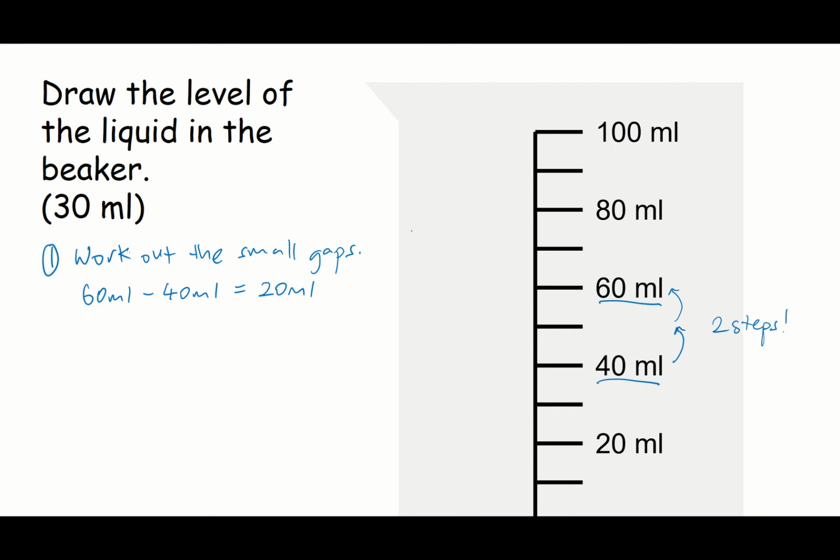You realize that for many beakers, you will not go to funny numbers like 3 steps or 7 steps or 9 steps, this kind of thing. Okay? So if 2 units equals 20 milliliters this time, 1 unit equals 20 divided by 2 equals 10 milliliters.